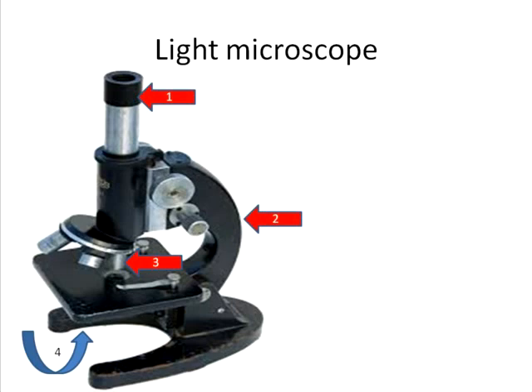Below the stage, you can see marked 4 is the condenser lens. This condenses all the light and makes it pass as a single beam of light below the stage. So actually the magnification is a product of the magnification of the eyepiece and the objective lens system.